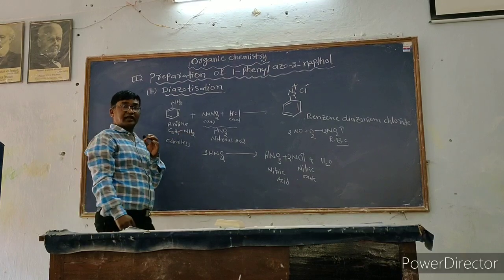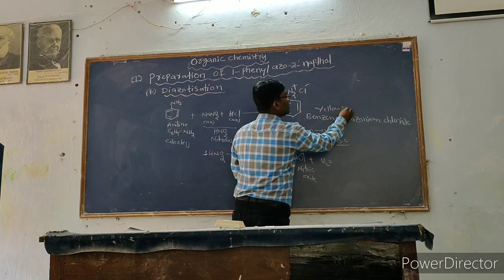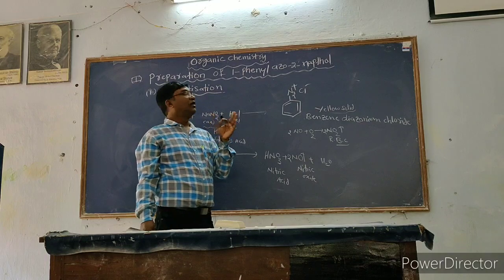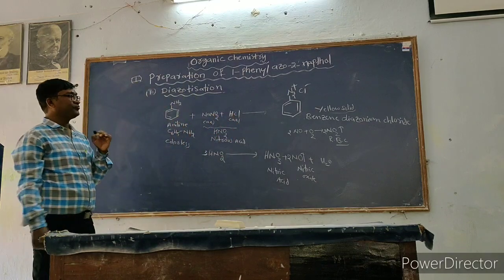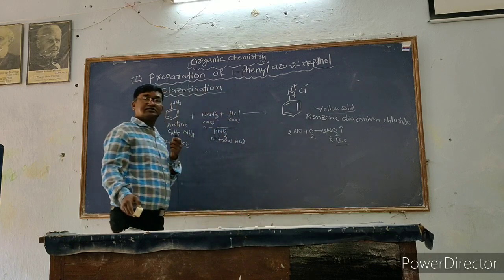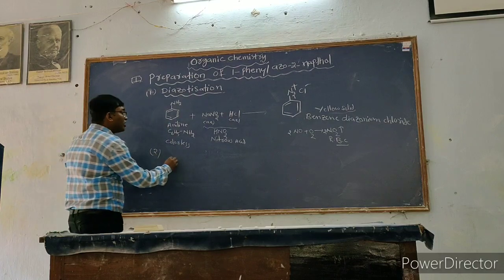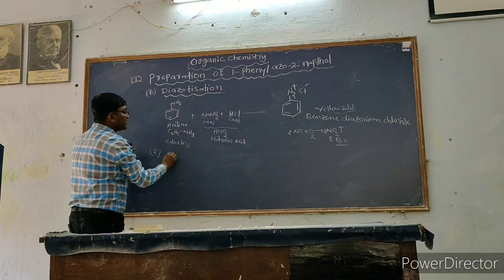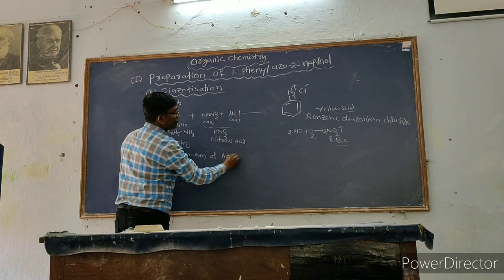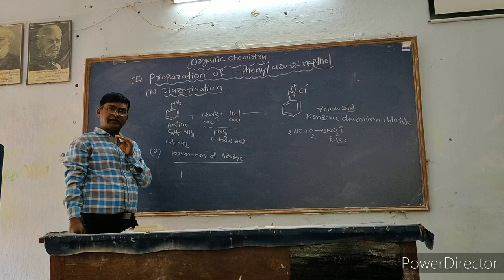All these reactions are colorless, and here you get a yellow color solid — benzene diazonium chloride is a yellow color solid. If you don't get the yellow color solid, you need to stop and restart the experiment. After getting benzene diazonium chloride, we proceed to the second step — the actual preparation step.